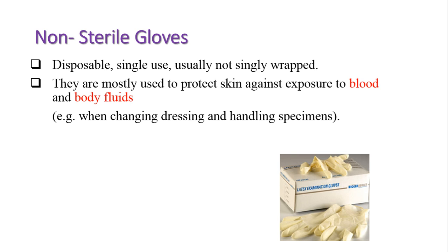Then we have non-sterilized gloves. They're also called powdered gloves. These gloves are also made up of latex and they are also disposable and single-use ones, right? Mostly this type of gloves are used in microbiology labs. We can even disinfect them by using disinfectants, and then after finishing our job, we can discard them. They are cheaper also and can be used effectively.